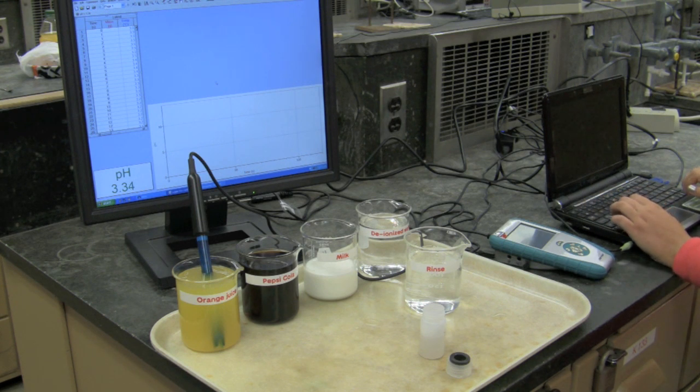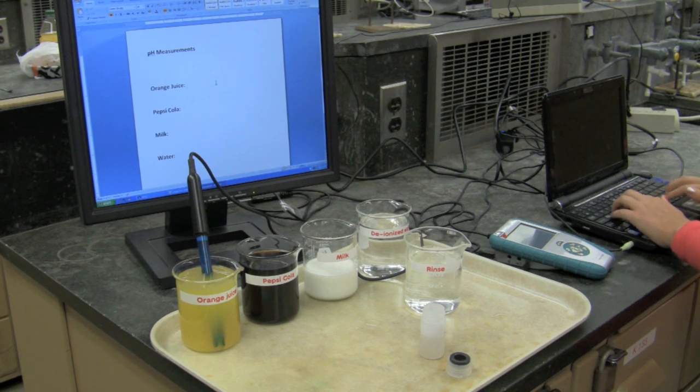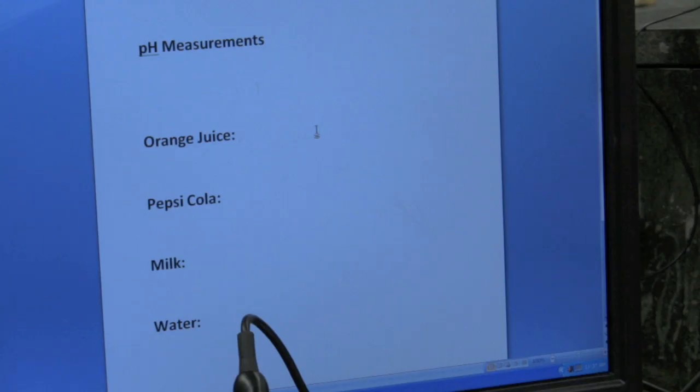pH equals 3.35. Alt-Tab, Document 1-Microsoft Word Non-Commercial Use, 3.35. That was it, right?